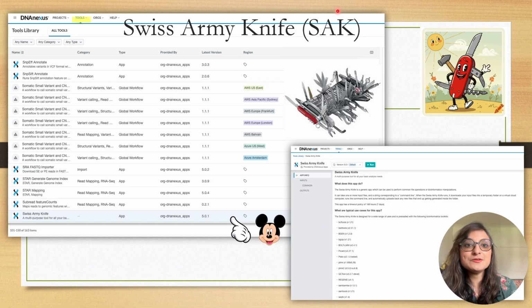Typical use cases would be extracting SNPs from BGEN using QC tool, as we'll see. Converting between genotype formats like BGEN to VCF to PLINK and so on, going back and forth between them. Filtering samples or variants, quality control, QC exclusions, running small data wrangling jobs, joining phenotype files, reshaping tables, quick exploratory stats or plots in R and Python, preparing subsets of data before sending them to heavier pipelines.